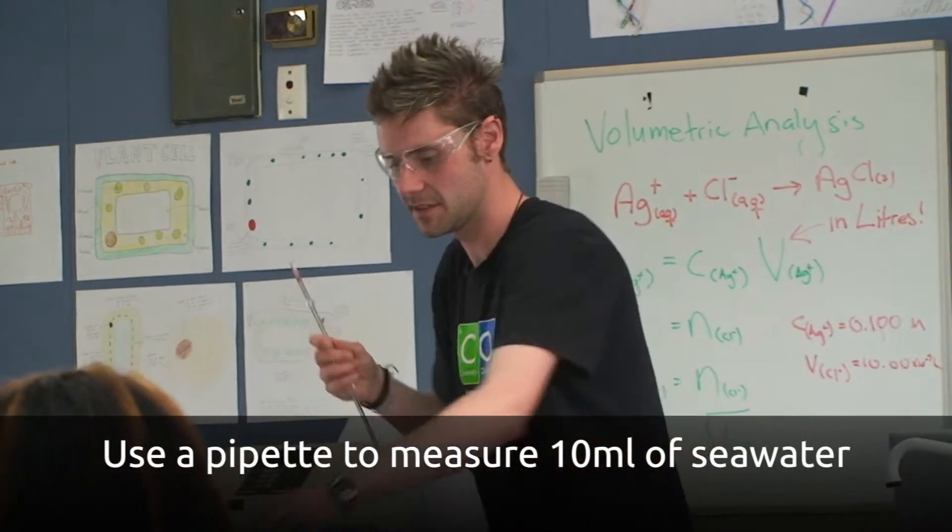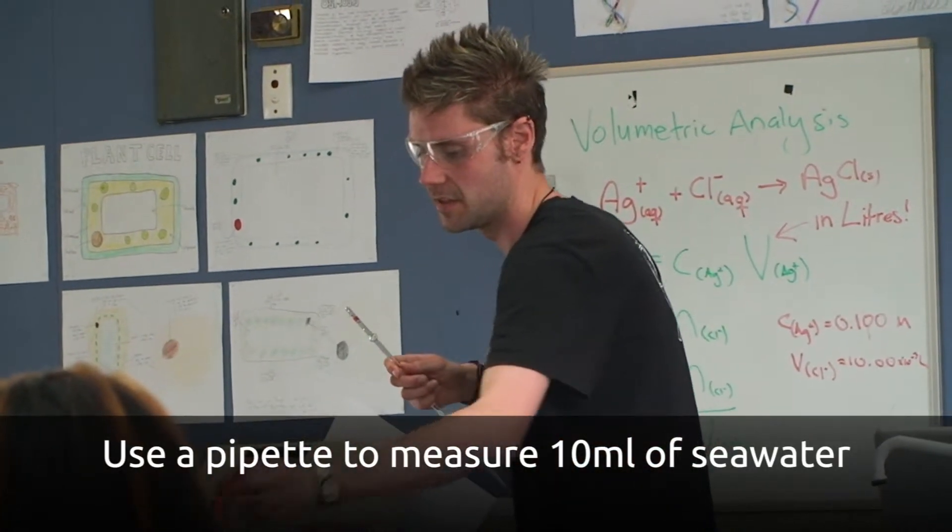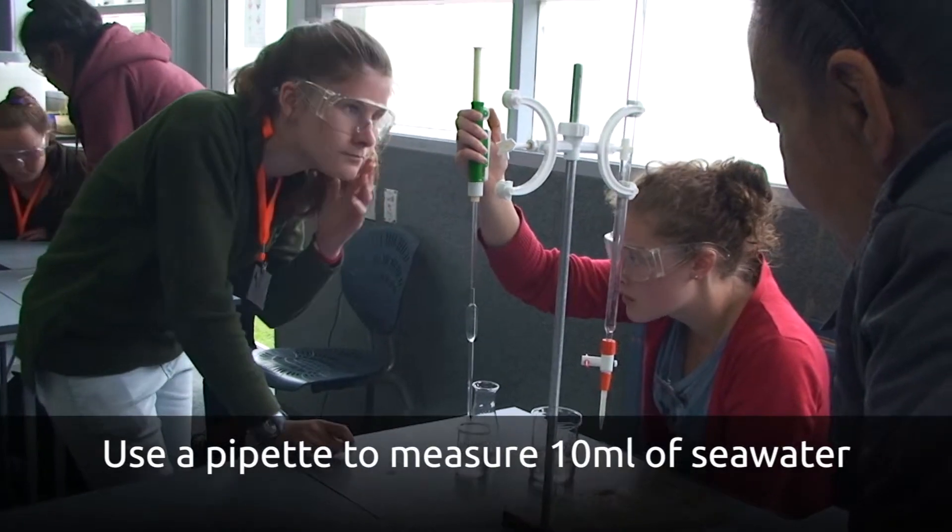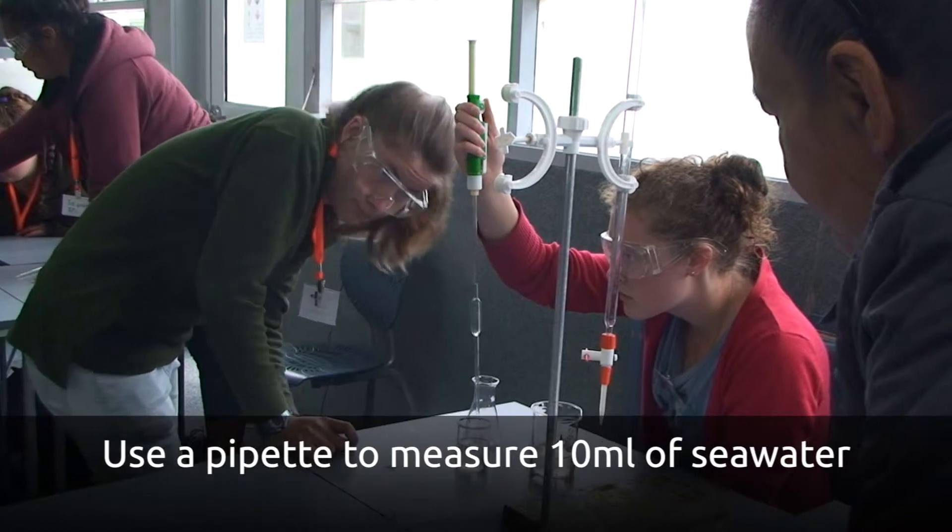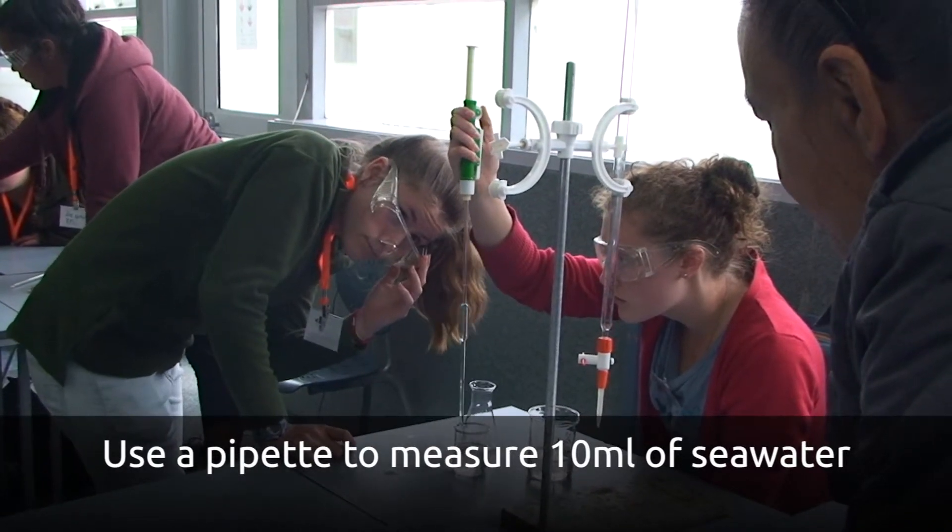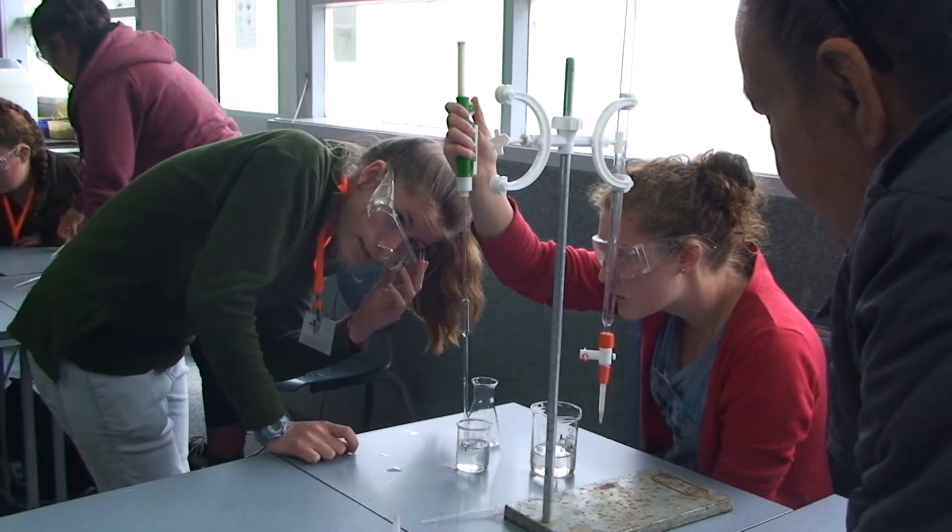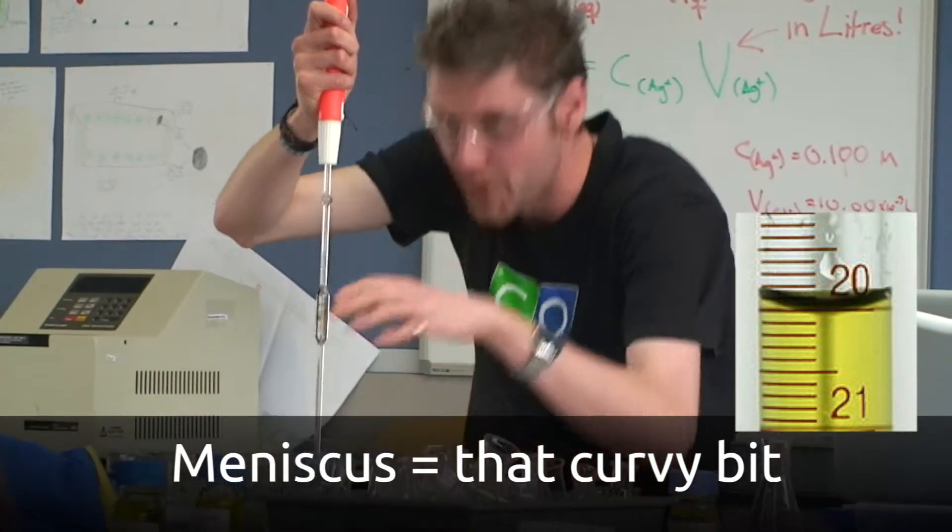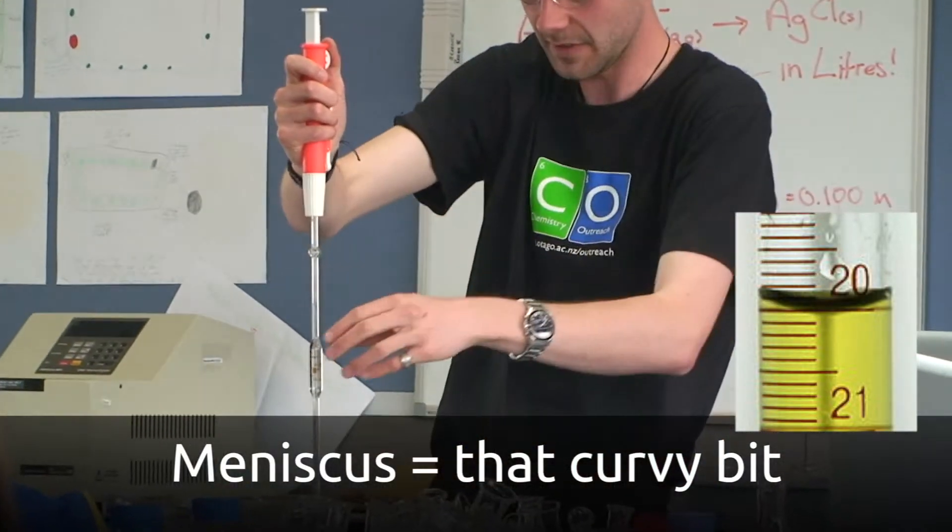And the way it fills all these up is with this nifty contraption known as a pipette filler. A pipette filler. It has a line, kind of like a measuring jug, and you fill it up so the bottom of the meniscus, that curvy bit, is on that line.